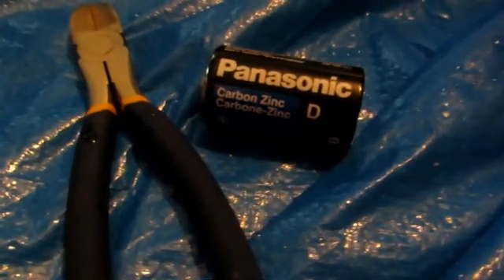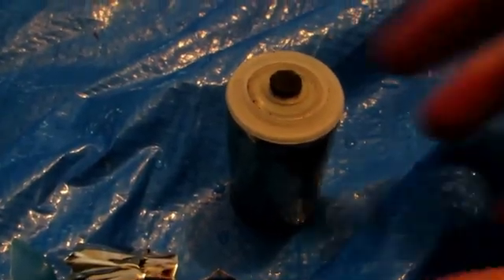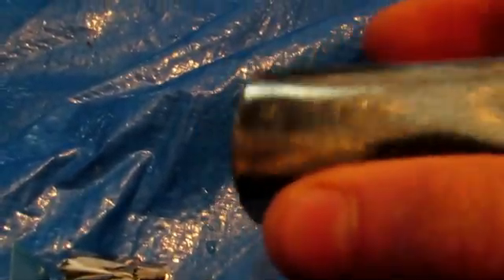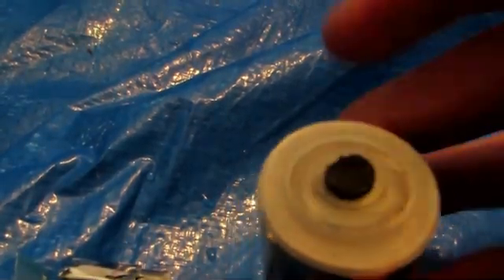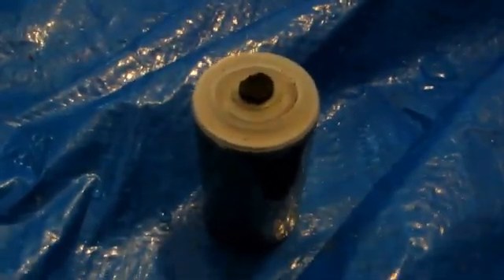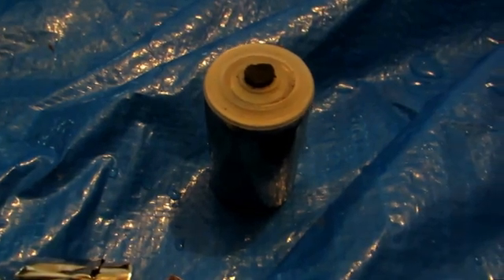To extract the zinc we're simply going to pry off the casing. So here we've opened up this battery. Here is the zinc casing which we are mainly after. The other components are this carbon rod and some manganese dioxide which is inside this battery. We're going to save the manganese dioxide because in a separate video I'm going to show you how to make manganese metal from manganese dioxide. Here is our nice zinc coating. What we're going to do is open this up, pull out the carbon electrode, and scrape out all of the manganese dioxide, and then you'll just be left with the zinc casing.